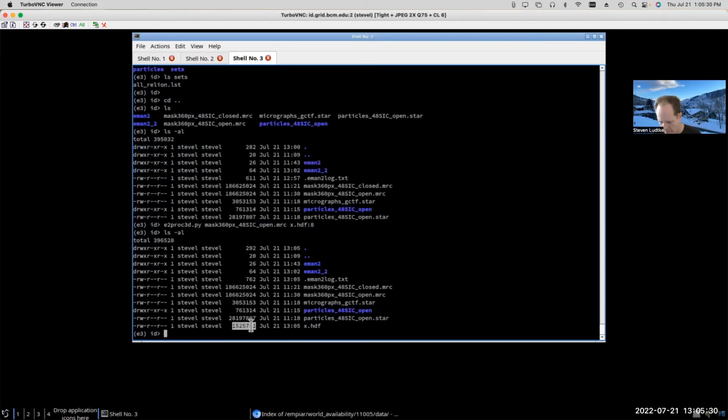The compressed mask file is actually only 1.5 megabytes. So it's about a factor of 100 smaller. And the nice thing about that is this file you could send by email. This file you would have to arrange for some sort of file transfer.